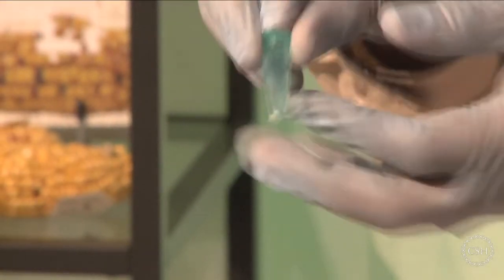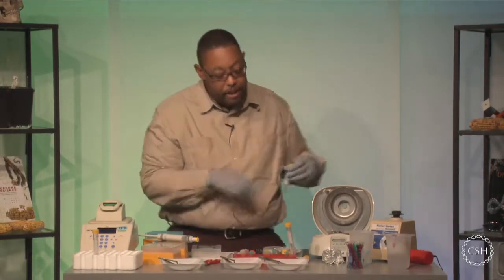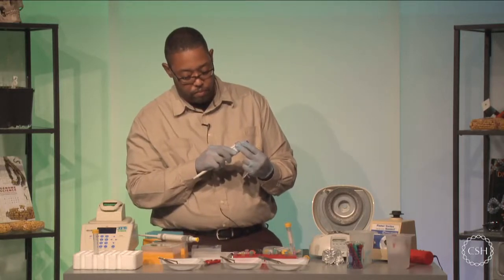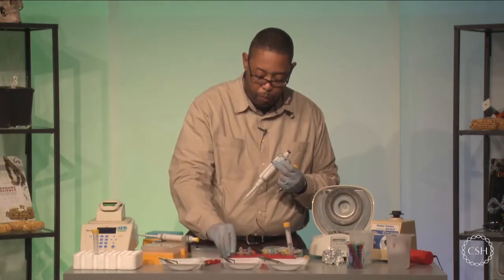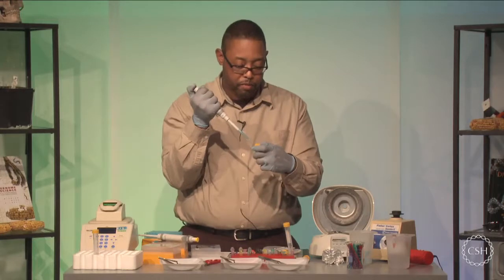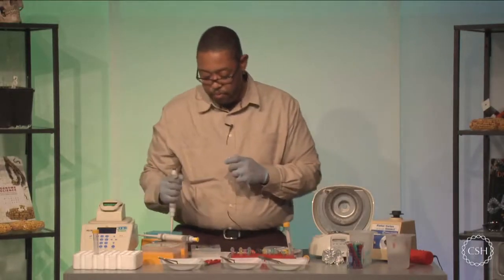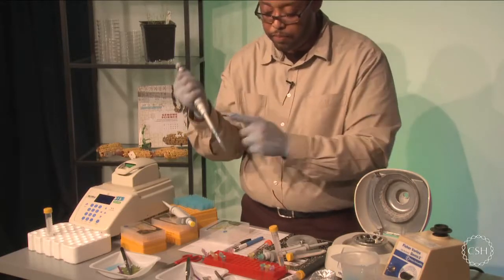Okay. Now, to each of these pellets, I'm going to add some wash buffer. So I'm going to go to my ice cold wash buffer over here to my left, and I'm going to add 500 microliters of this solution to each of my test tubes. Okay. I'm just going to open up all my test tubes here on the table. And what I'm going to do is drop 500 microliters of my wash buffer and add that to each test tube. Again, be mindful to make sure that you're changing tips each time that you add wash buffer to each test tube.